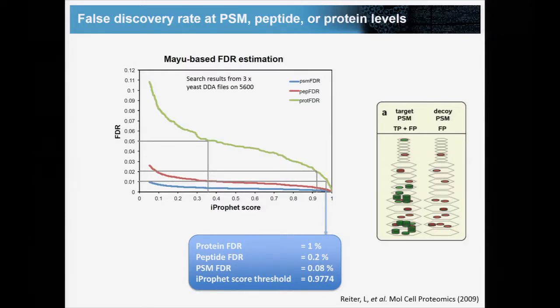And then I would like to make just maybe one more comment just to make sure that you really got this. These differences between protein, peptide and peptide spectrum match FDR will vary. How big these differences are will very much depend on the size of your data input. So the smaller the number of runs that you combine into a library, the smaller the differences.